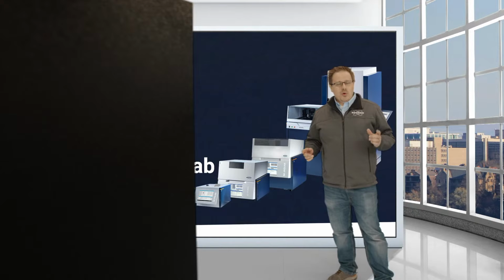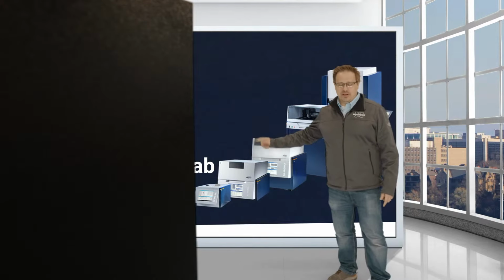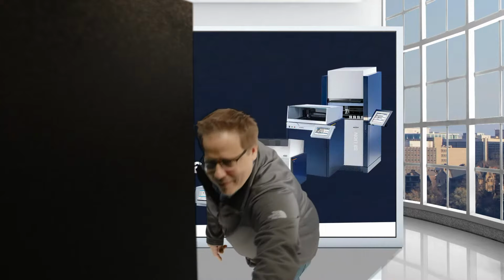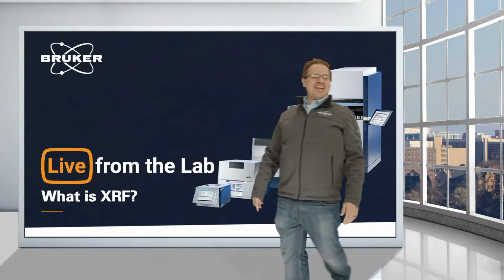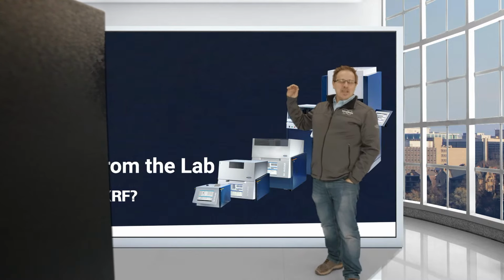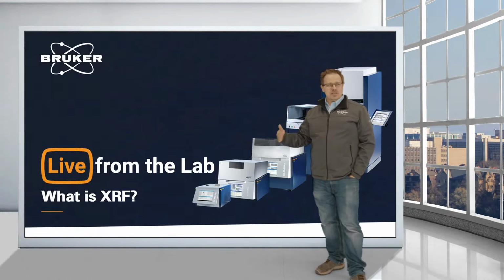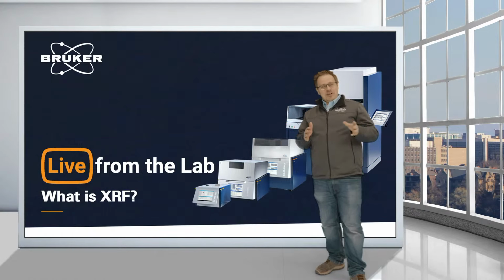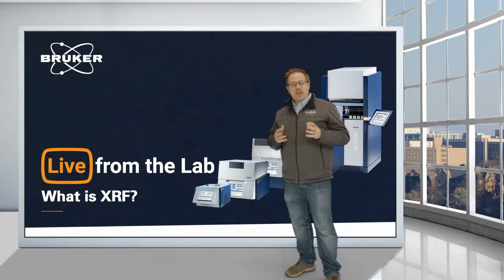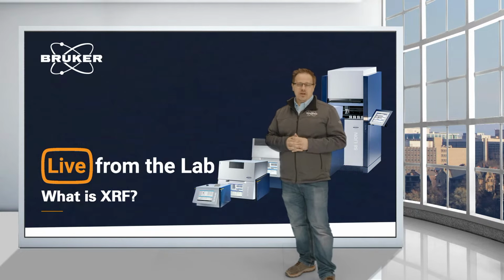In this show, we are going to talk about what is XRF. Actually, let me clear that up a little bit for you. All right, so what is XRF? XRF stands for X-ray fluorescence spectroscopy, and it is used in order to quantify the elemental composition of things.